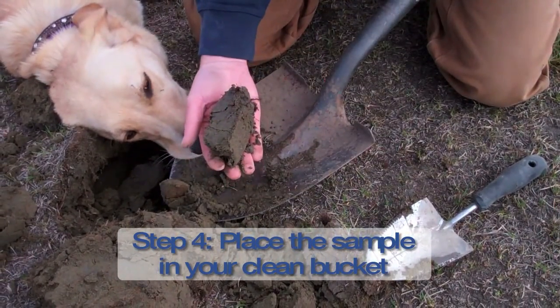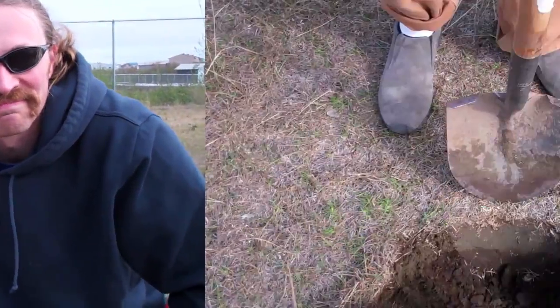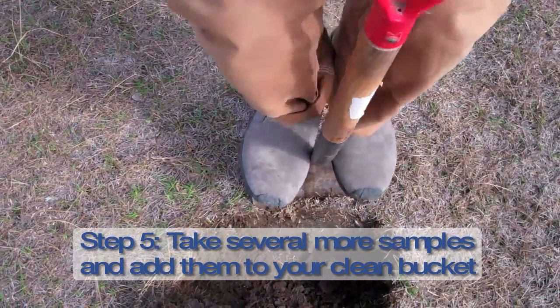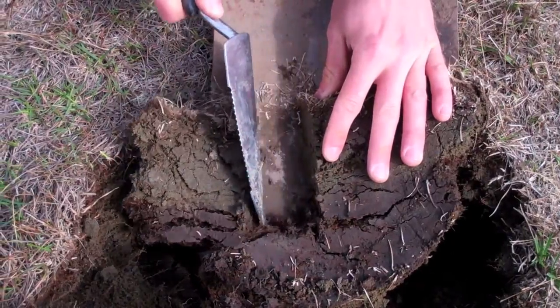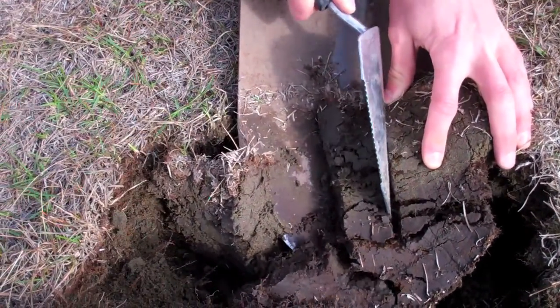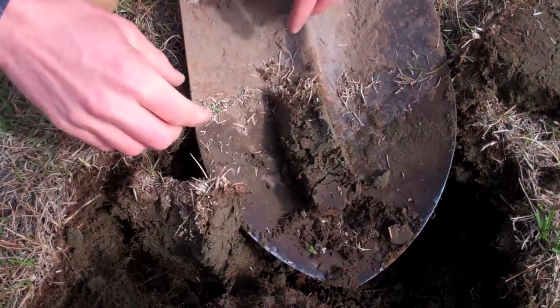We're gonna take that and put it in the bucket with our other samples, and eventually we'll mix them all together. I'm just using a hand trowel here. If the soil is real loose, you could use your fingers. Cut through that turf top and there you have a pretty good soil sample.